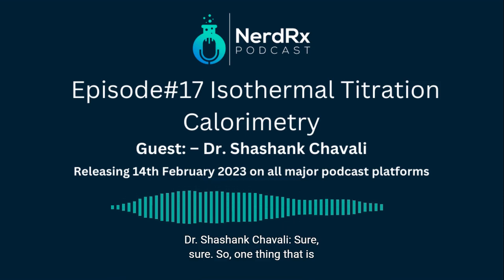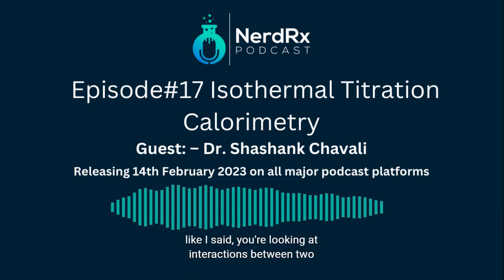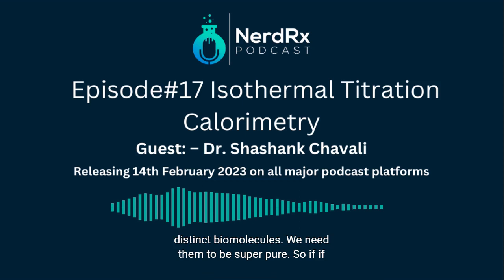Sure. So one thing that is required in ITC is you basically need purified samples, because, like I said, you're looking at interactions between two distinct biomolecules. We need them to be super pure.